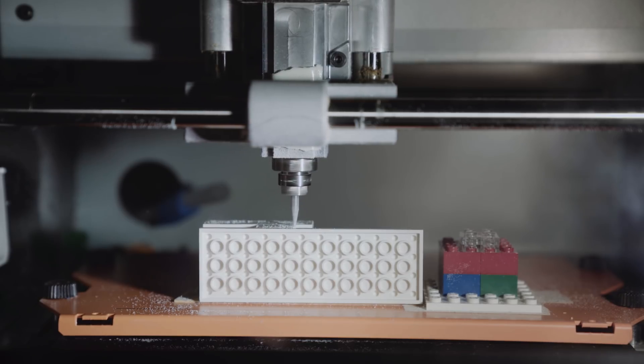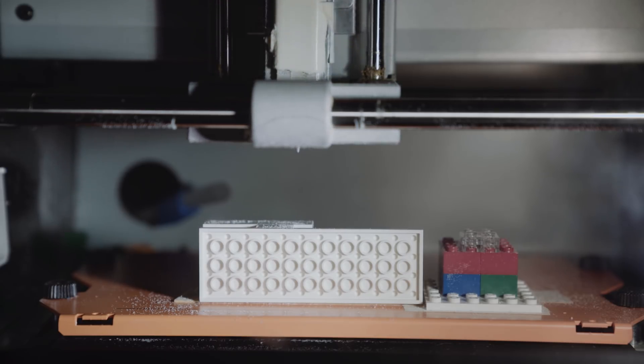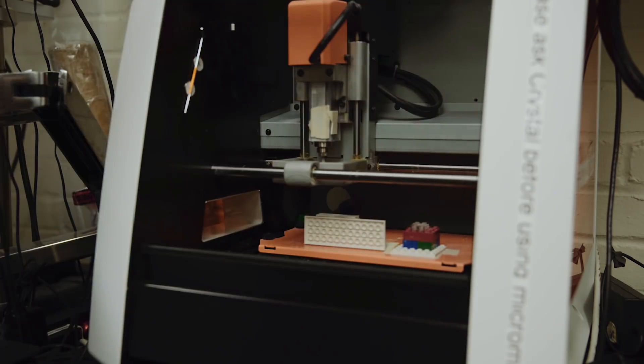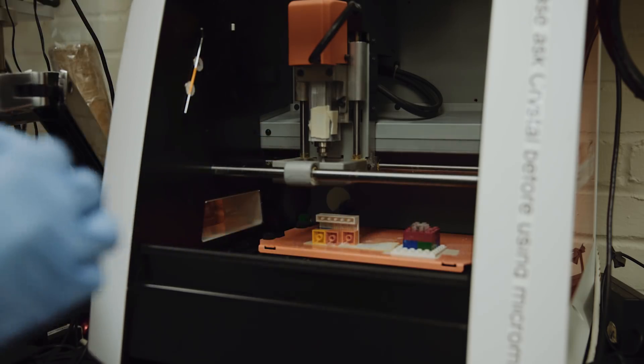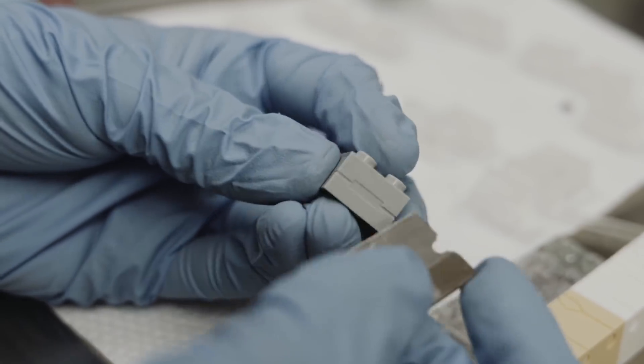Using micromilling, a well-established technique commonly used to drill extremely fine features into metals and other materials, the researchers can engineer each brick to have a particular pattern of channels to perform a specific task. Once the channels are drilled, additional modifications can be done by hand, and then a clear film is placed over the wall to seal it.